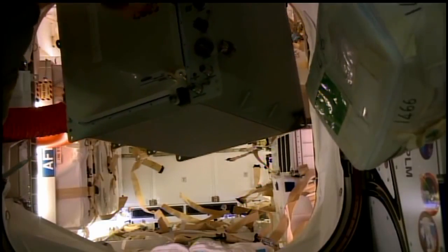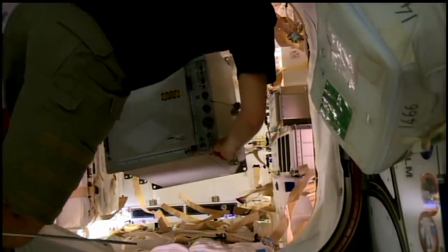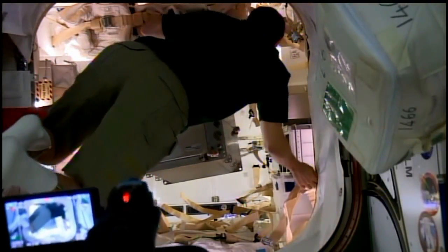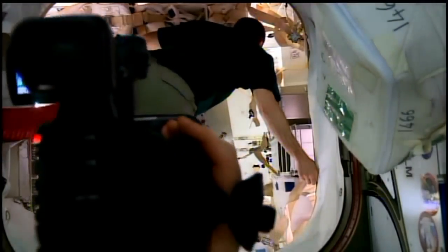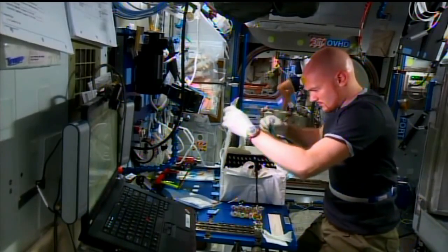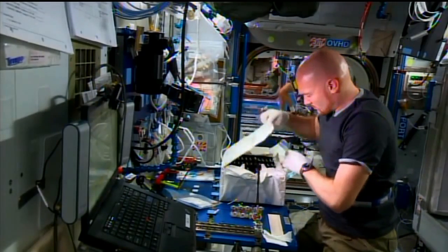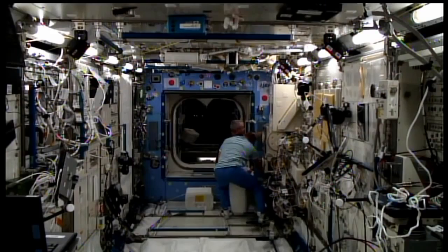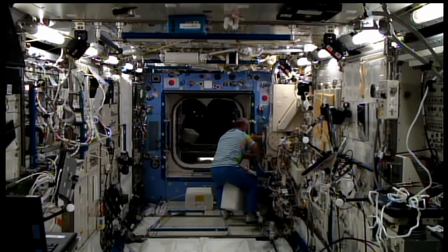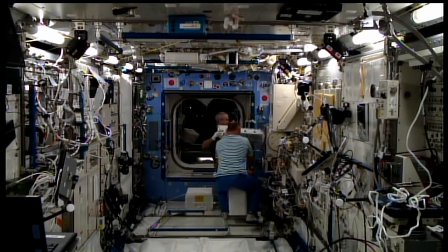So the GLACIER can also be commanded from the ground, which is why it's vital, correct? Oh, absolutely. The temperature can be commanded from the ground, so if we have different experiments that require different temperature profiles, we can command that from the ground. And the University of Alabama in Birmingham is the hardware developer, and they did this for the cold stowage group at JSC. And so in collaboration with Sharon Campana at JSC, I was able to bring the facility here on loan for 6 months. I actually worked for the University of Alabama in Birmingham prior to coming to NASA, and so I have a good relationship with them and the cold stowage team.